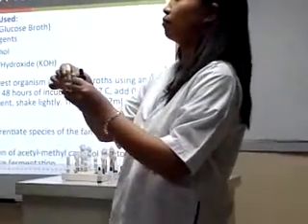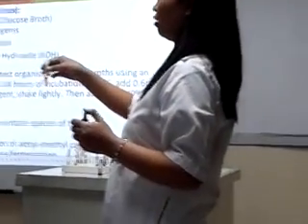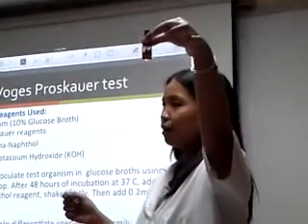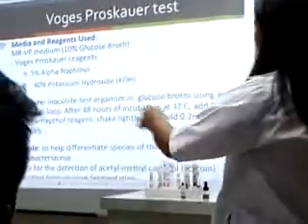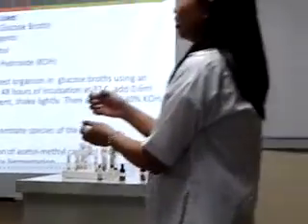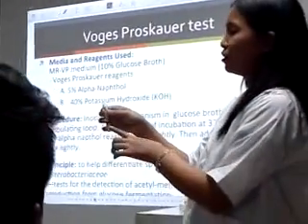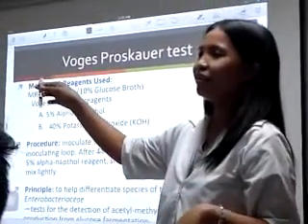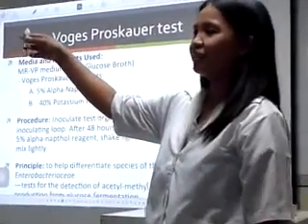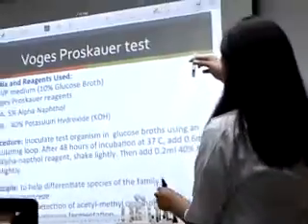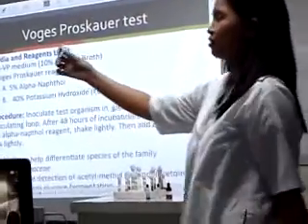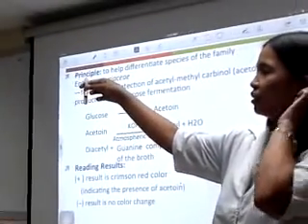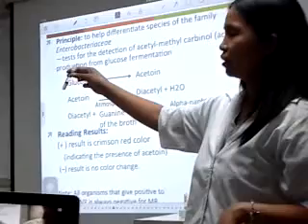For the Voges-Proskauer test, that is still the 10% glucose broth. You add 0.6 ml of your 5% alpha-naphthyl reagent. The reagent was already prepared because it will take 30 minutes to react. So you add your alpha-naphthyl and then swirl lightly. Afterwards, you add your KOH. That gives your positive result — you will have a crimson red color.